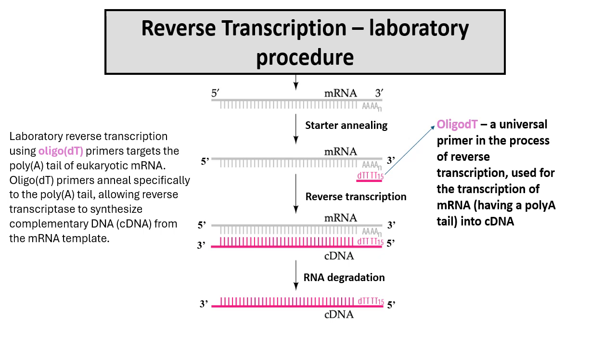In the laboratory, RNA cannot be directly amplified using PCR reaction. Therefore, to detect the presence of RNA, most commonly we are interested in mRNA, this molecule must be first converted into the DNA through the process of reverse transcription. In fact, it is converted to so-called copy DNA, cDNA. And conversion and obtaining cDNA allows us to amplify and analyze the copy DNA using PCR reaction.